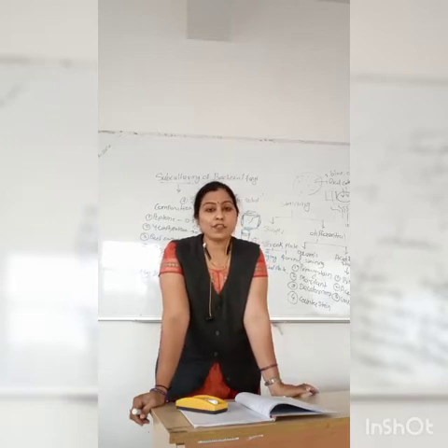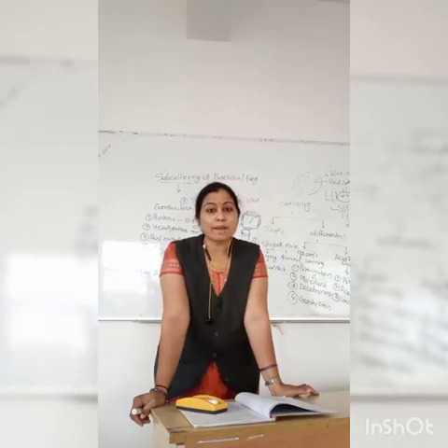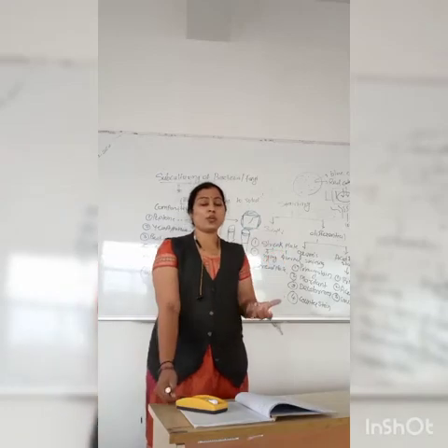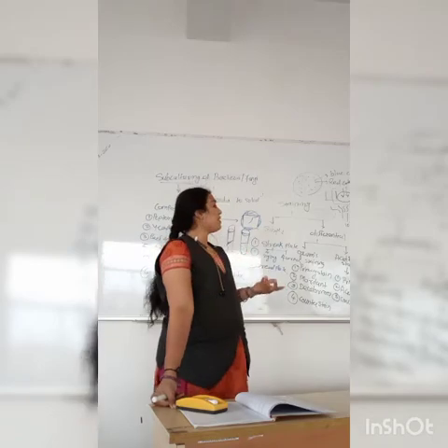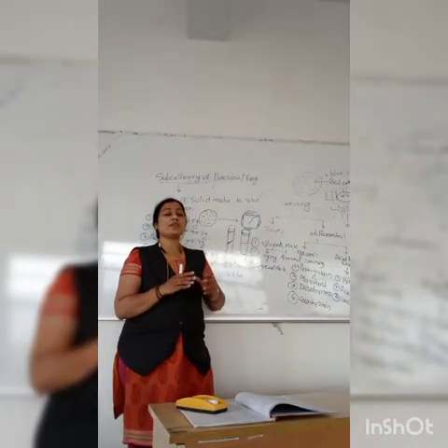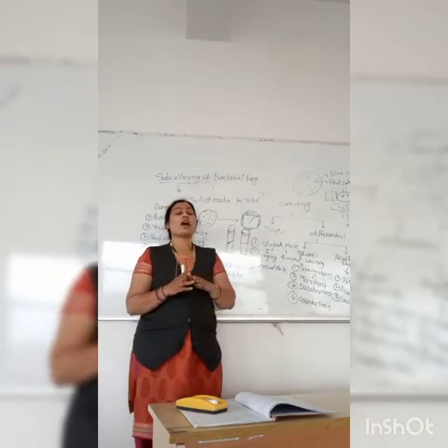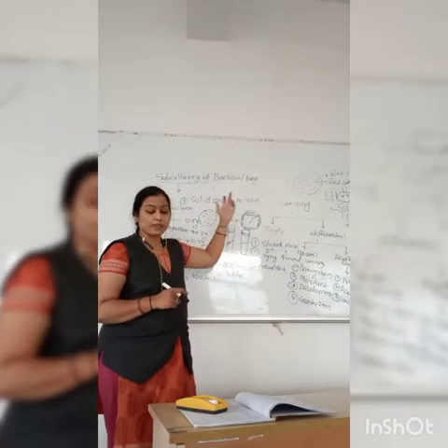And why are we performing the subculturing? To preserve the culture. When you are preserving the culture, it should be transferred into freshly prepared media from time to time. If you are doing this this week on Tuesday, you should repeat this process next Tuesday. Why? Because the culture will stay alive. You have to move it from the used media to freshly prepared media after a fixed time period. That is the subculturing process.